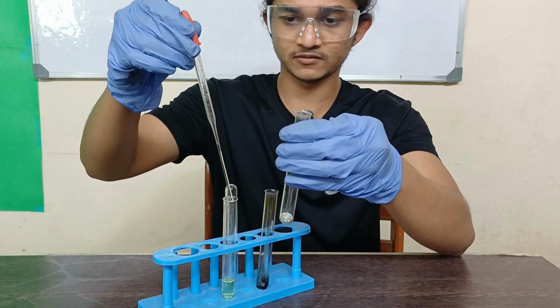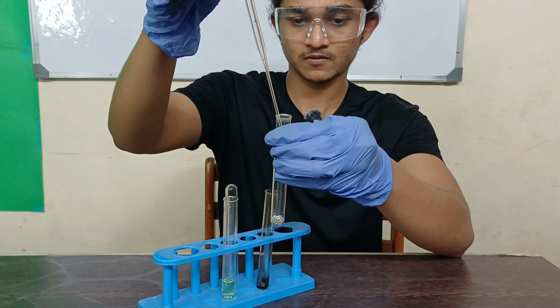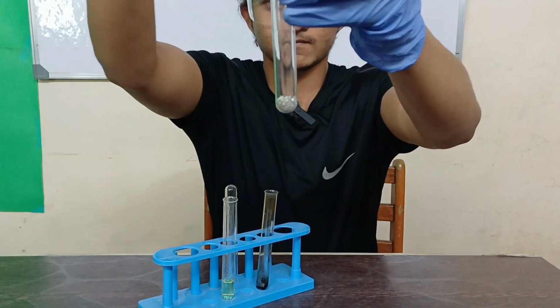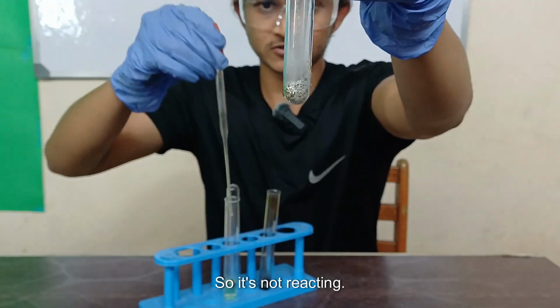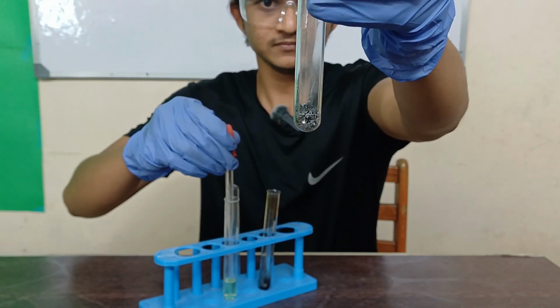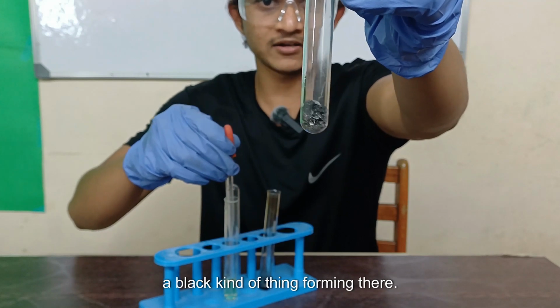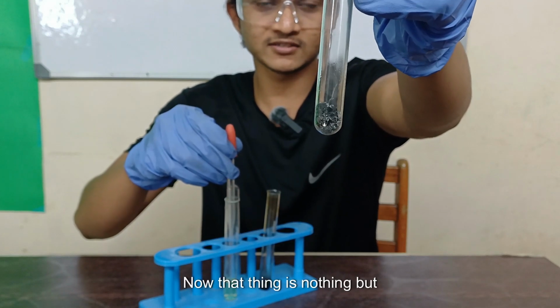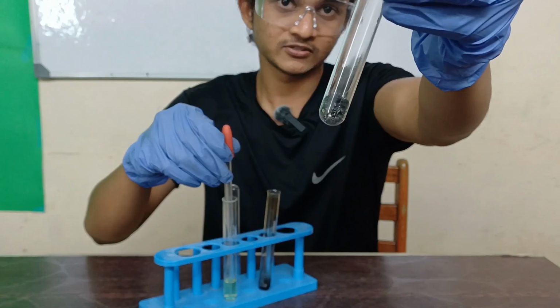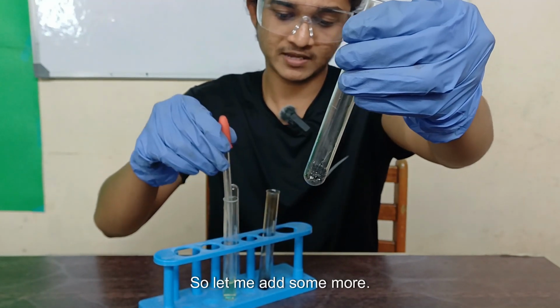I've taken the hydrochloric acid. You can see the fumes coming out. It's not reacting. Yeah, it started reacting. You can see a black thing forming on the corner of the test tube. That thing is nothing but aluminum chloride, and the gas which is being produced here is hydrogen gas. Let me add some more.